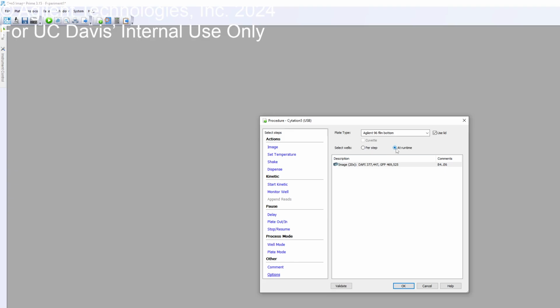So for the kinetic, I can set up a line item where I can pause it, open it up, and then add whatever I want. And it'll continue recording after closing the incubation? So you want to collect a baseline image, and then you want to add your reagents and then read after that, right? Yeah. So there is also a mode which basically you do this. This is your baseline right here, and then you set up a read step afterwards. So you then start a kinetic and then collect. You right click on this, copy this, paste it here.